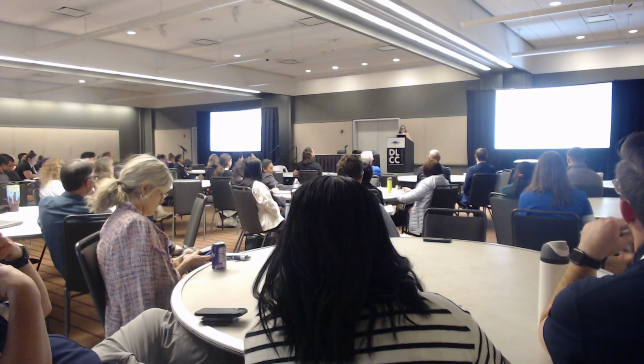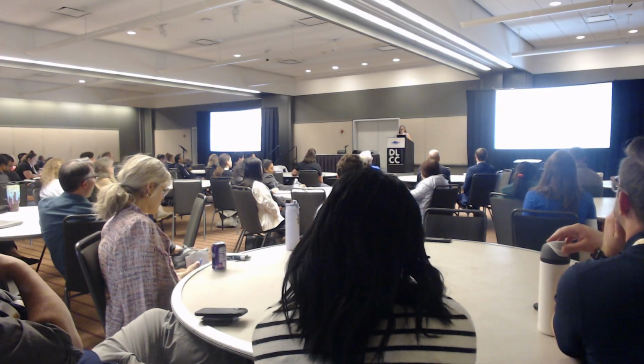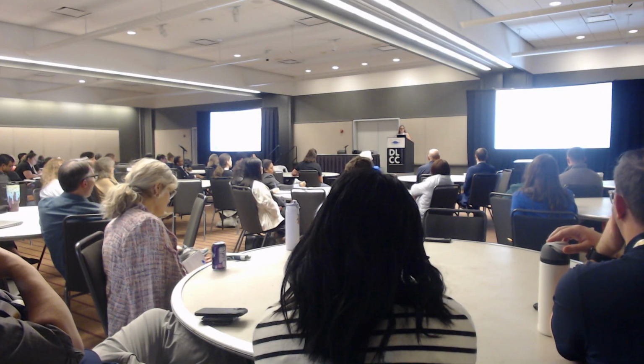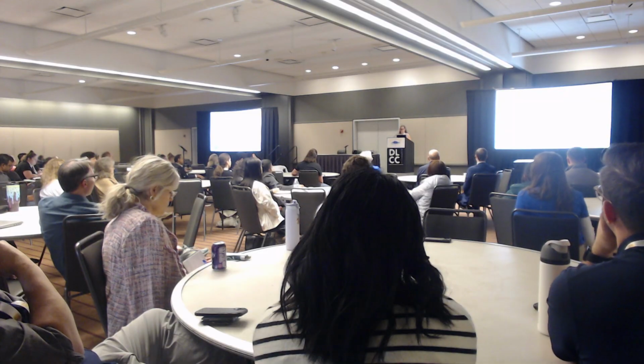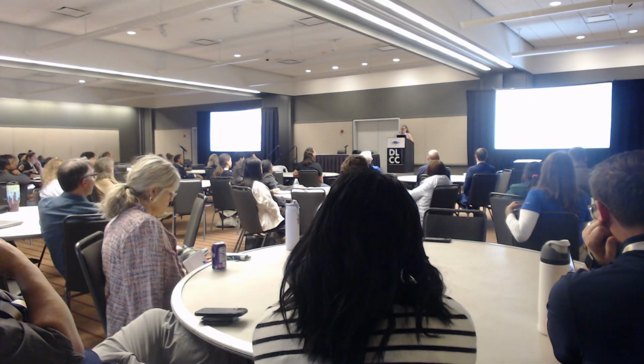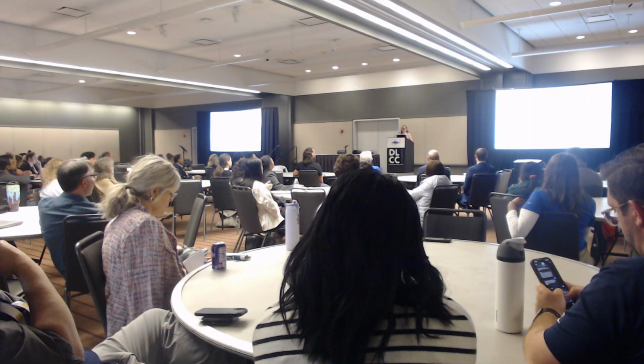So when we're looking at adaptive approaches, a lot of times it's investigator driven or we see trends. I see a lot of my colleagues who run genomics cores here. I think it's a no-brainer that spatial transcriptomics was going to go in each and every one of your cores, because that was a trend. It was a no-brainer to put it in.